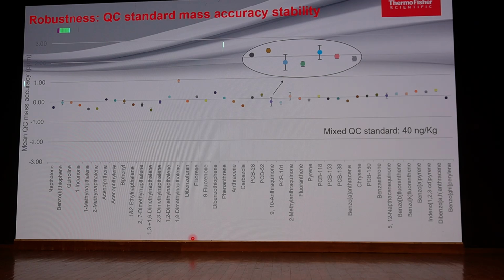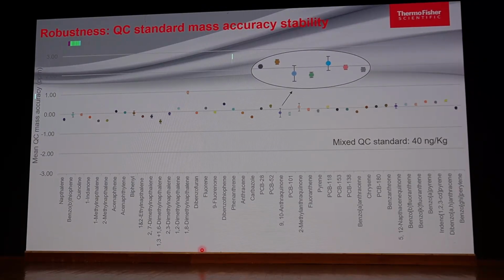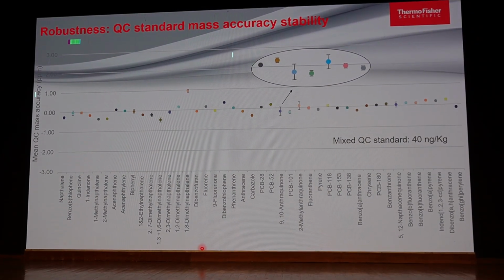This is again cross-checked with the QC standard, certified standard, and this is also a mandatory requirement when you are demonstrating any results. So you should see that with reference to QC or certified sample, you are monitoring the confidence with respect to mass accuracy. So how much mass accuracy you are achieving for the target or certified material. That also gives you another level of confidence.